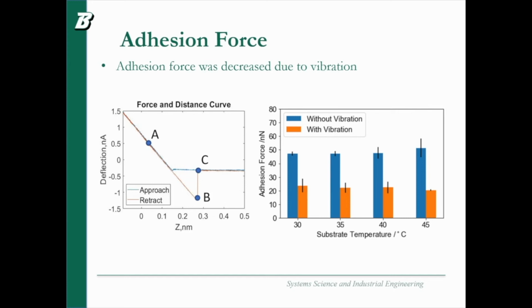So the vibration actually decreases the adhesion force a lot. That facilitates the nanomanufacturing process, the nanomachining process. You can see that is without vibration and with vibration.